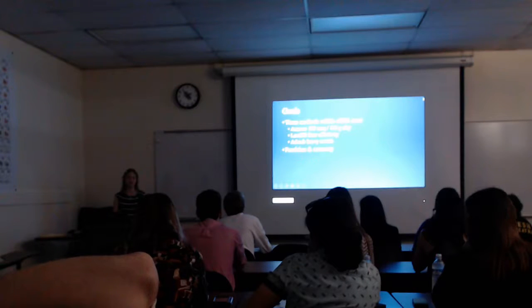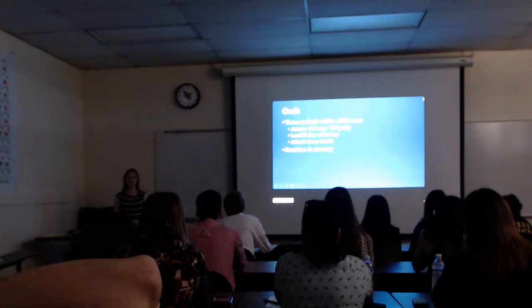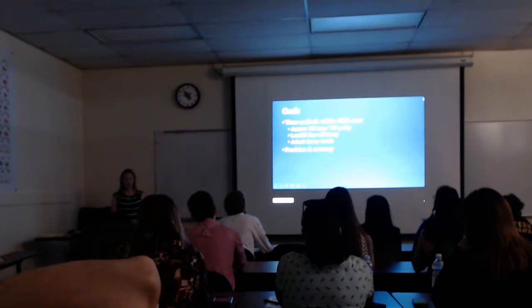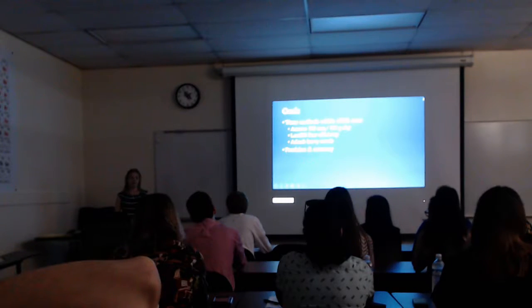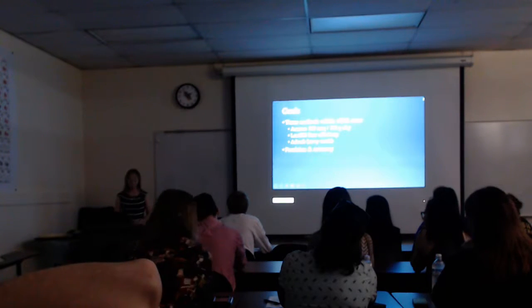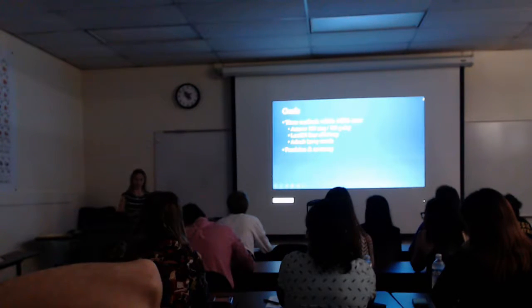But if it reads as 100 and is actually 80, it will exchange far fewer of those heavy metal ions and allow more of them into the environment when it's put into use, if you've undershot the CEC. So we want our methods to be both precise and accurate, which, because these are older methods, we're hoping that newer technology that we are using will actually result in that increased accuracy and precision.